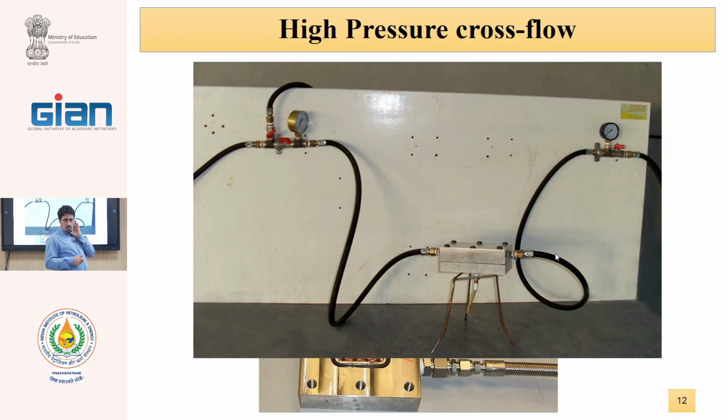When we want to control the flow and pressure, the pump begins to work and circulates the water, but with closing of this valve, we can increase the pressure.